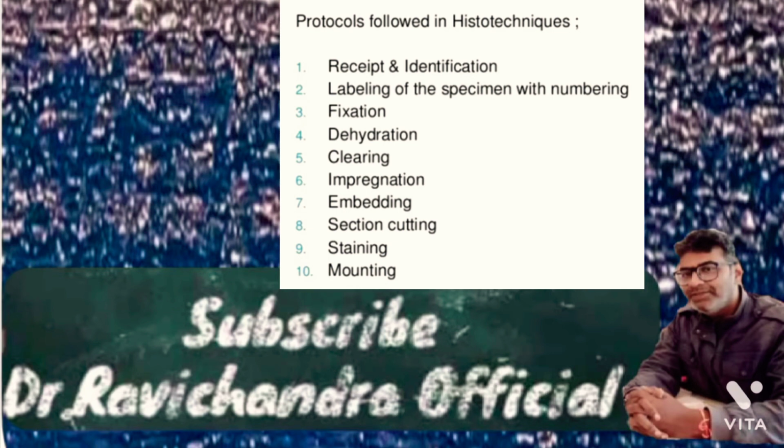maintained in a register. Gross examination. Tissue removed from the body for diagnosis arrives in the pathology department and is examined by a pathologist. When a malignancy is suspected, the specimen is covered with ink in order to mark the margins of the specimen. Different colored inks can be used to identify the different areas if needed.